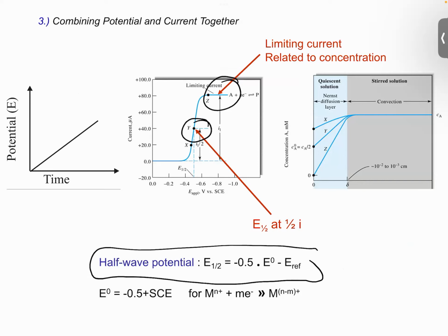That is supposed to be unique for each analyte of interest. If it is cadmium 2+, you have a certain half wave potential, but if it is plumbum 2+, you have a different half wave potential. But it's not, of course, as specific as, for example, mass spec. It's just a guide, but it is quite a robust technique.